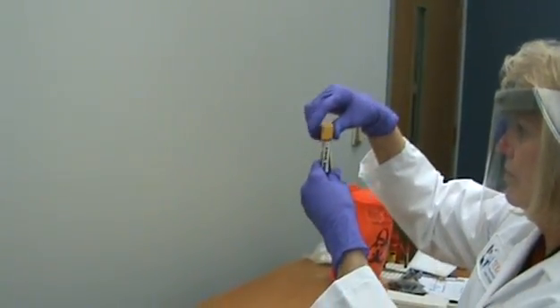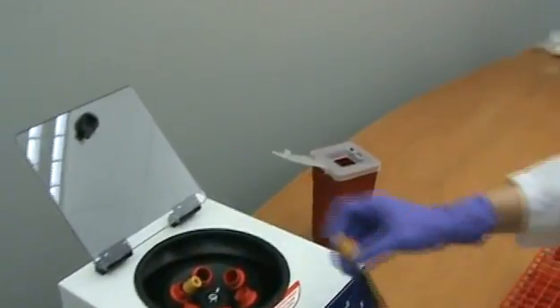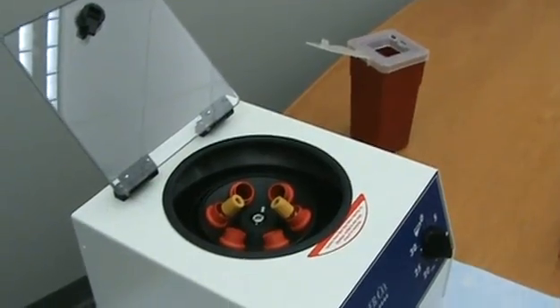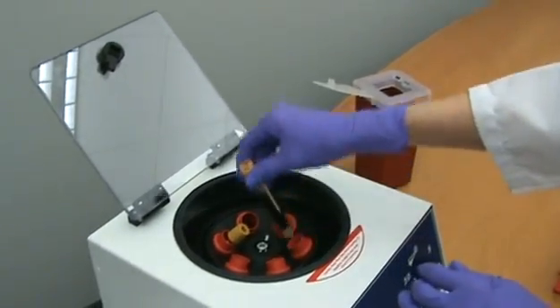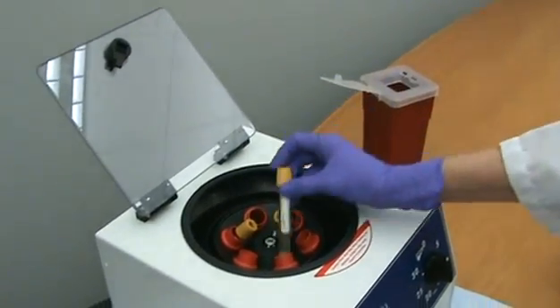When centrifuging specimens, it is very important to ensure that the centrifuge is properly balanced. Improper balancing can cause damage to the centrifuge, personnel, or specimens. Tubes of the same type and size should be compared and matched according to similar fill volumes.